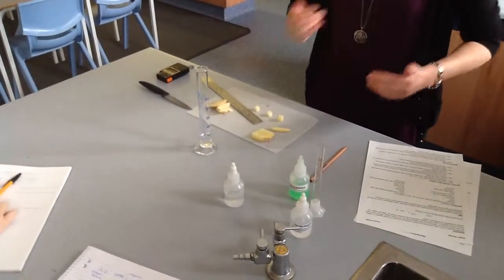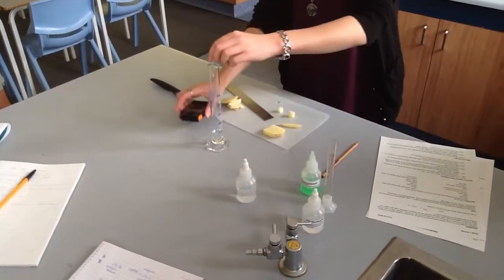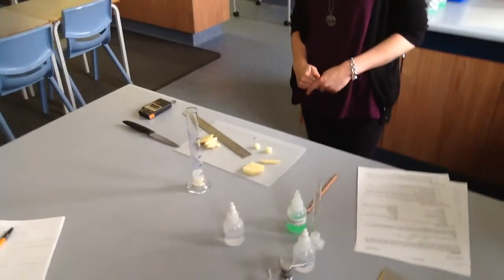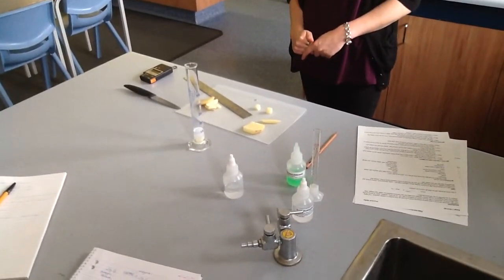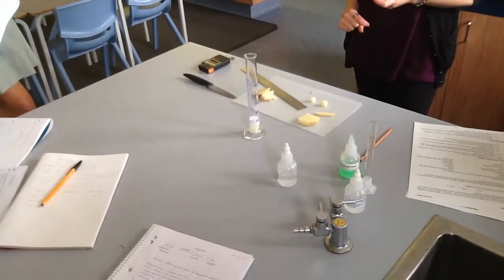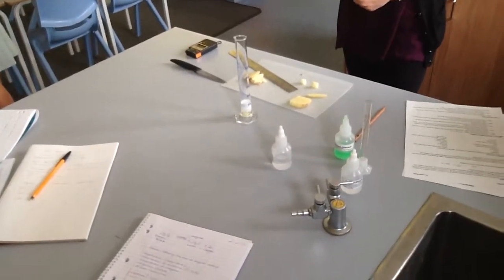Okay, so I'm going to say 2 minutes that I'm going to run it for. All right, so I can see oxygen bubbles forming. I can see a little bit of froth. Now remember, that was a fairly high concentration, and I already had 10 mils in there. So what am I going to have to do when I get the total volume? I'm going to have to minus the 10 mils of hydrogen peroxide that I had in there. So it's frothing up, that's about 30 seconds.